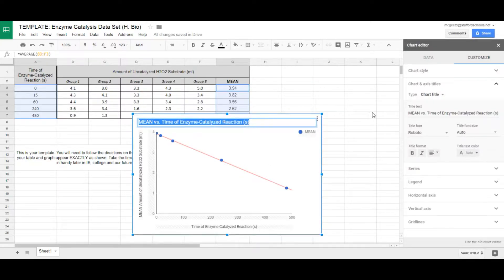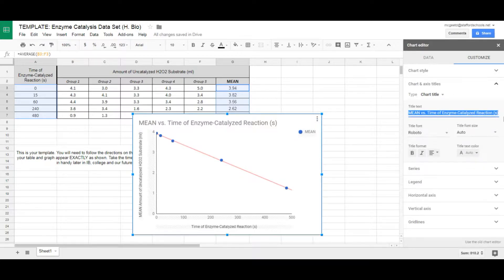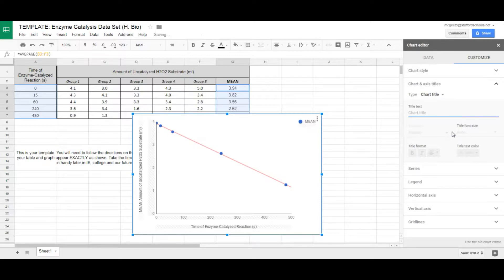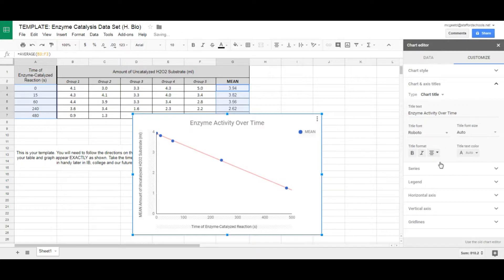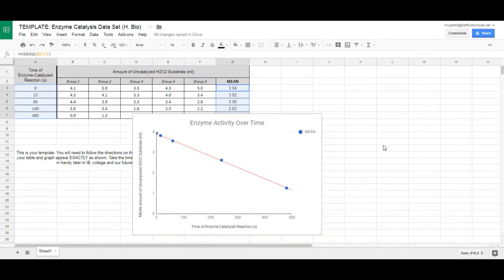The graph is almost finished, but we still need a proper title. 'Mean' is not a good graph title. Change it to something that describes the entire graph — for example, 'Enzyme Activity Over Time' or 'The Effect of Enzyme Reaction Rate Over Time.' The title should describe both the independent and dependent variables together. I like it centered.